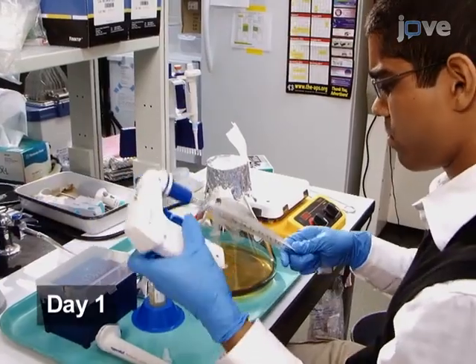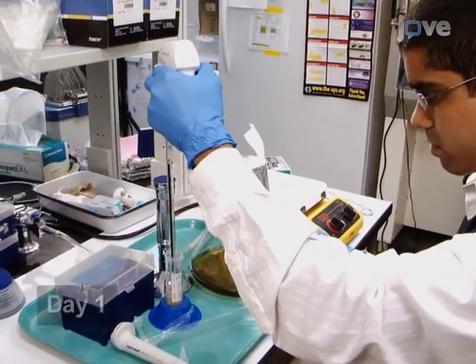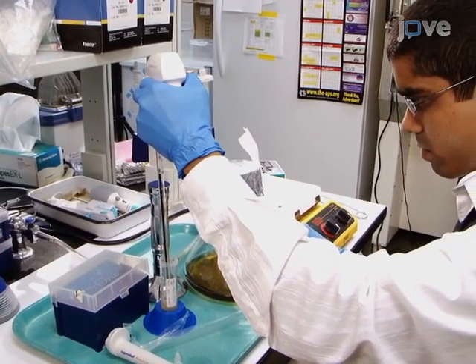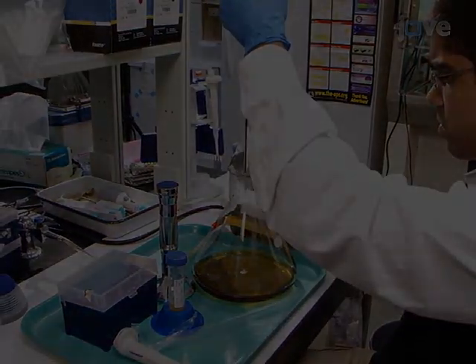Prepare bacterial worm food ahead of time. Begin by inoculating 500 millilitres of terrific broth supplemented with 50 micrograms per milliliter of streptomycin with 5 millilitres of saturated E. coli OP50.